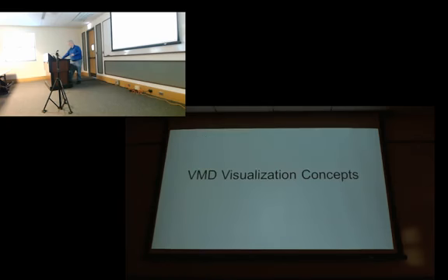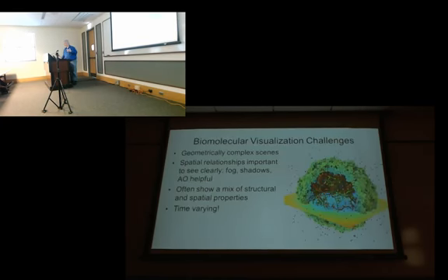So I'm going to switch gears a little bit and tell you about the visualization aspects of VMD, and that's really where I put most of my effort recently. And just to give you an overview of what VMD is able to do, why it's designed the way it is, and sort of what its strengths are, and the concepts behind how it works.